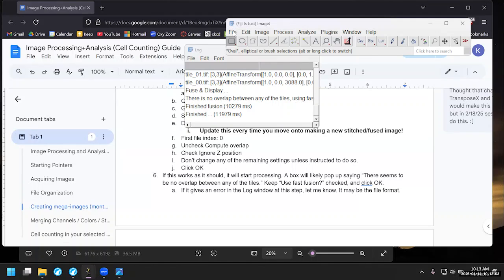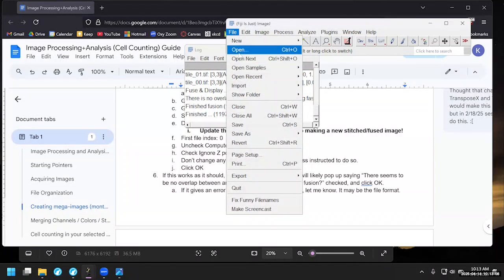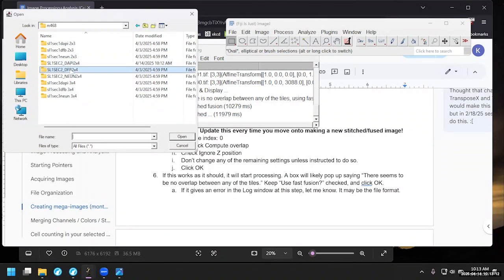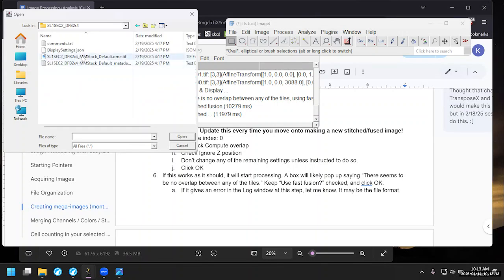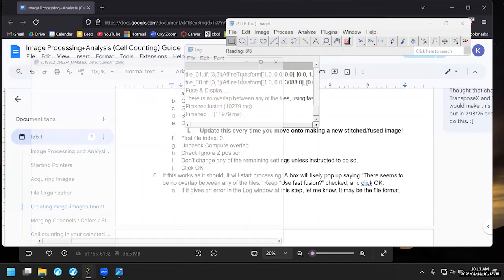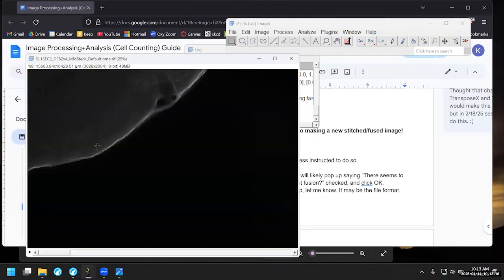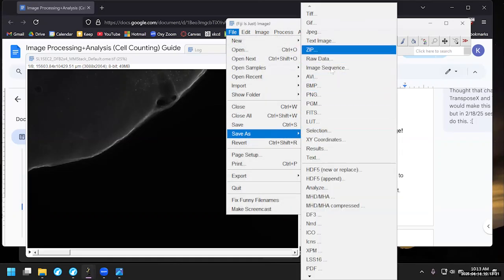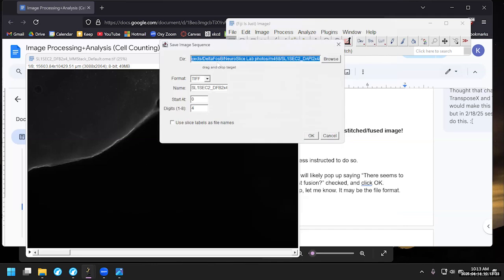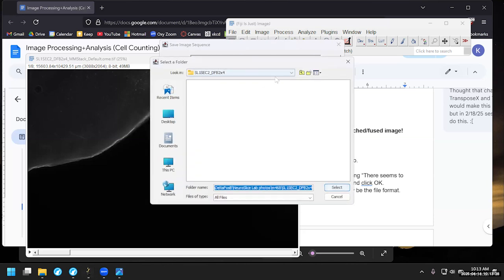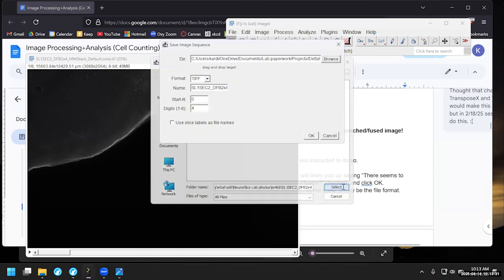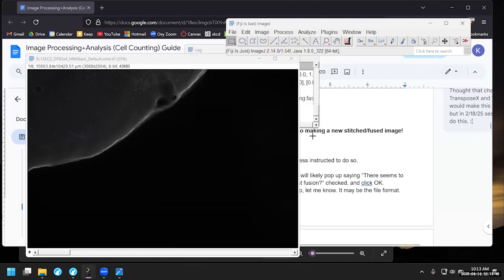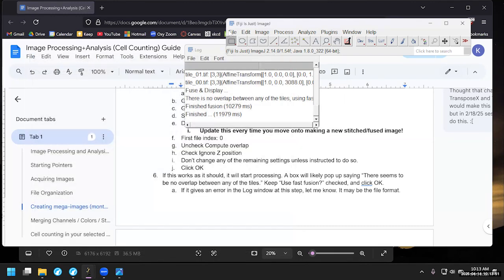And then we can now close this. We can also close the image stack file we were working with before. Now let's go ahead and do it again for the other two channels real quick. So go to Open, go up a directory. I'll go now to the green channel labeled by the marker we used. Same sort of setup. We will save it as image sequence. We will make sure it's going to the correct directory. It is not yet, so we'll hit browse. Now it's going to the correct one. TIFF. As I mentioned, we have to change the file names. So tile underscore zero, two, leave all the rest as is.